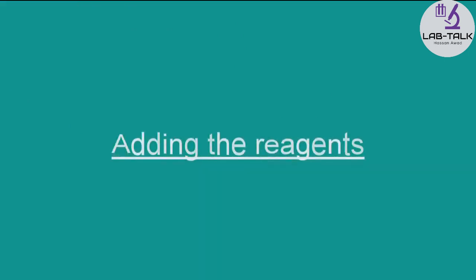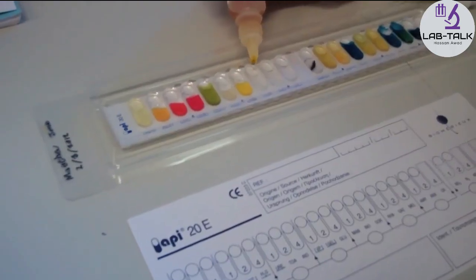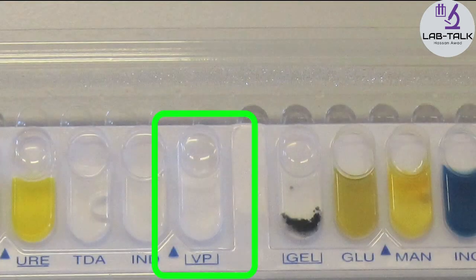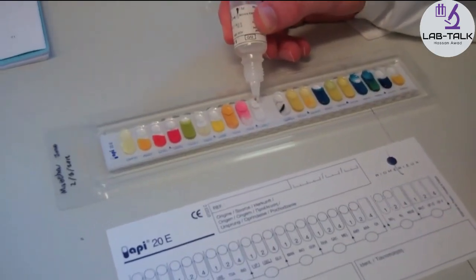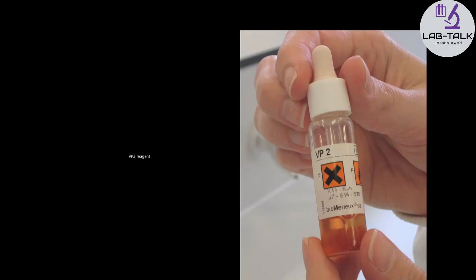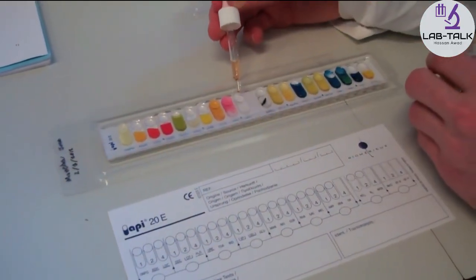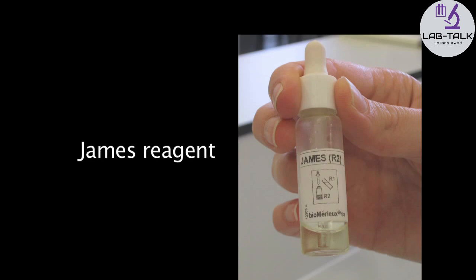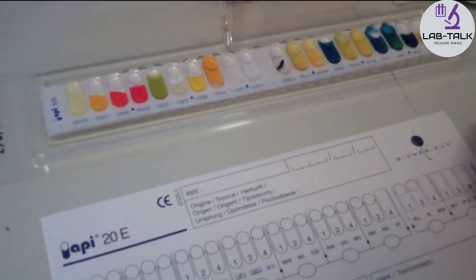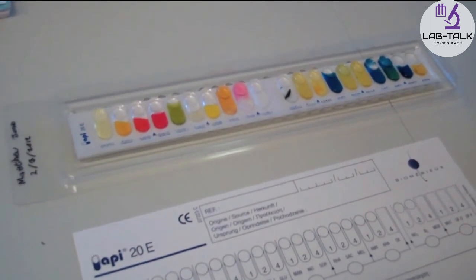Adding the reagents. The TDA reagent is added to the TDA cupule. The Voges-Proskauer test requires two reagents, VP1 and VP2. First, VP1 is added to the VP cupule, then VP2 is added. This allows detecting bacteria that utilise glucose through the butanediol pathway; acetoin is detected via colour change reaction with VP1 and VP2. The James reagent is added to the indole test cupule. Indole as an end product may be detected by the reaction with James reagent, and a pink colour change indicates a positive reaction.